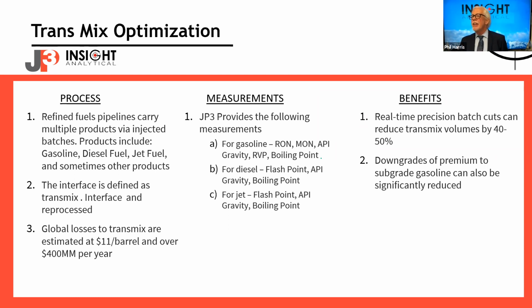Samples we get checked from the lab of the end user. If it can't be done, what's the alternative? So we end up using a lot of third-party labs. We'll use Maxxam, or in Canada, it's Maxxam, Agat, a few other labs where we send the sample to them for the analysis. So with the analyzer, we tell it we're pulling the sample now, we send it out for analysis, and then we get the analysis back in a week, and we start adding that information into the model.